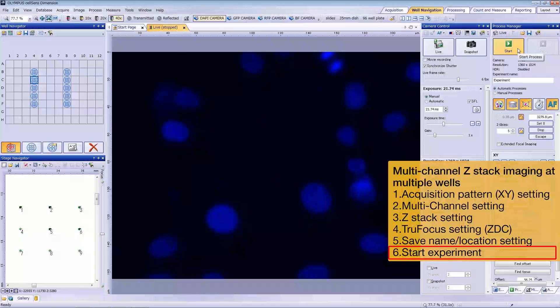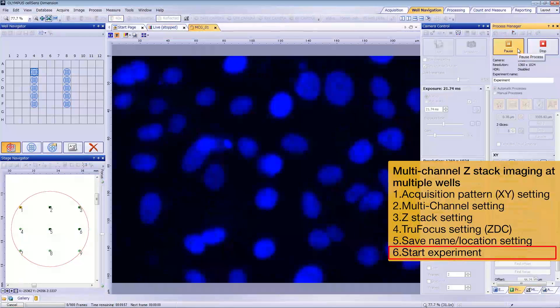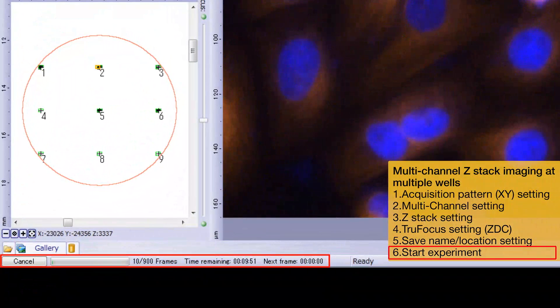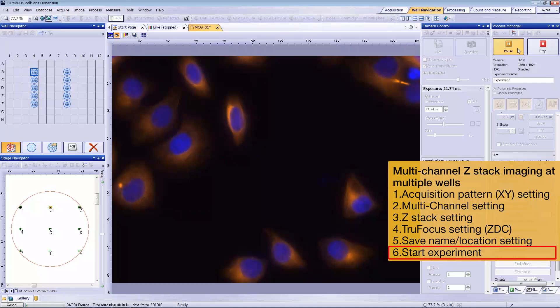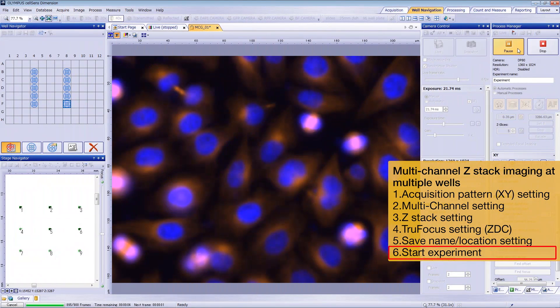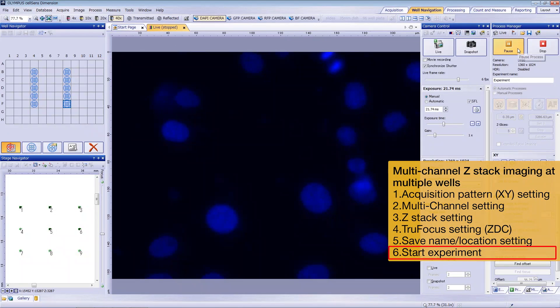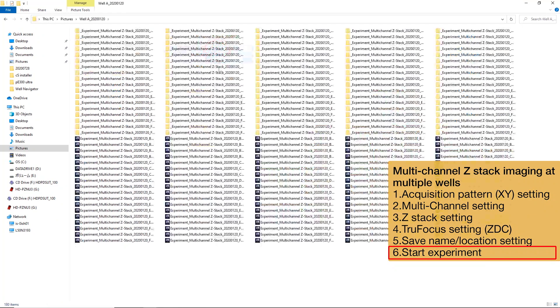We are ready to start the acquisition. Click Start. 2-channel Z-Stack images are acquired at each point. The number of frames and time remaining are displayed on the lower left of your screen. The focus is good thanks to the TrueFocus Z-Drift Compensator. The acquired images are not opened, but instead are saved per our acquisition settings. The experiment is done. Let's check the save location. Make sure the folder is available according to the acquisition settings — 90 images are available.